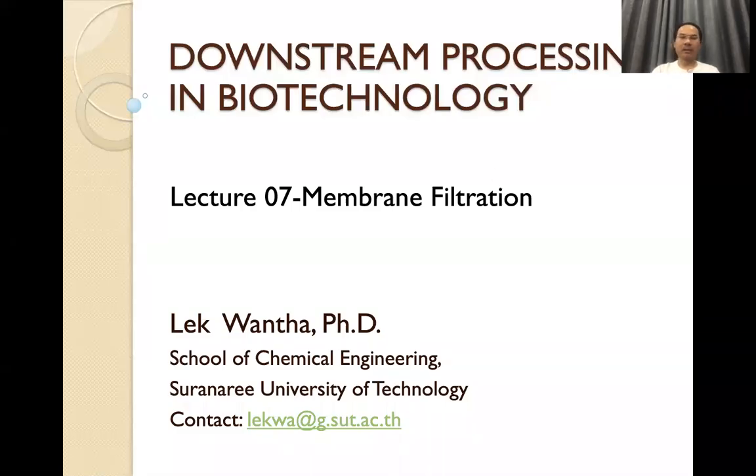Hi everybody, welcome to the lecture on downstream processing in biotechnology. In this lecture we will focus on membrane filtration.